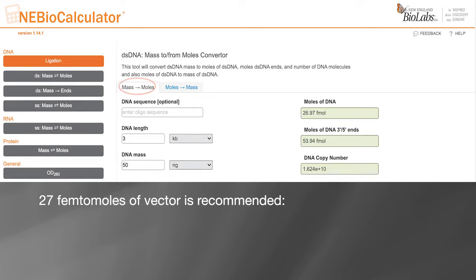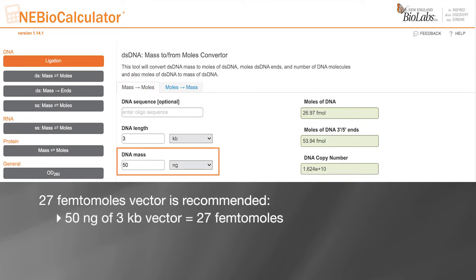Using the NEBioCalculator double-stranded DNA mass to moles module, we determine that 50 nanograms of a 3 KB plasmid is 27 femtomoles. Therefore, we need to calculate the amount of mass of the 6 KB plasmid that will equal 27 femtomoles to have enough DNA ends for a ligation.